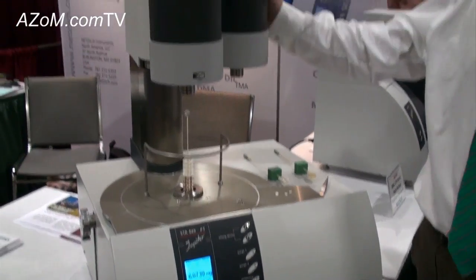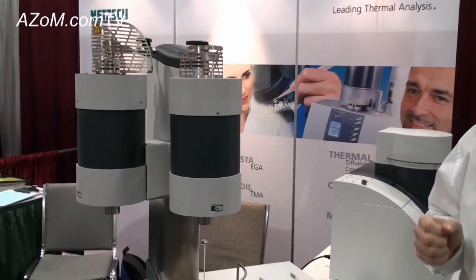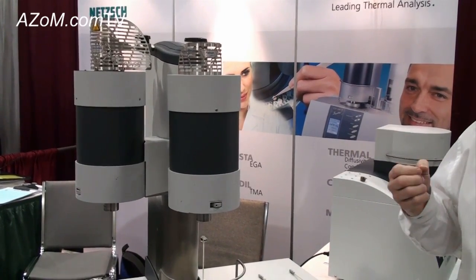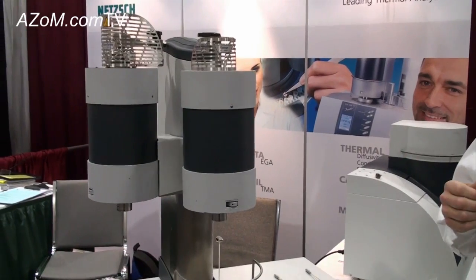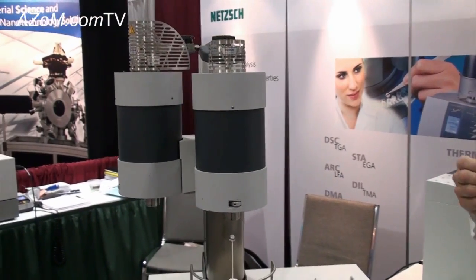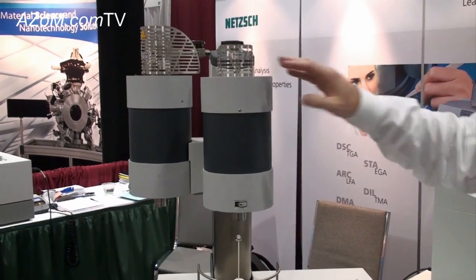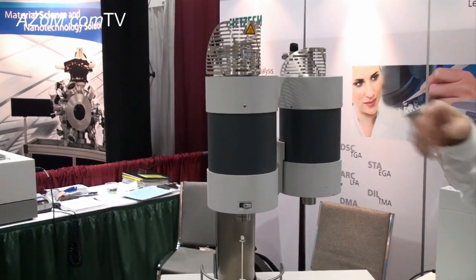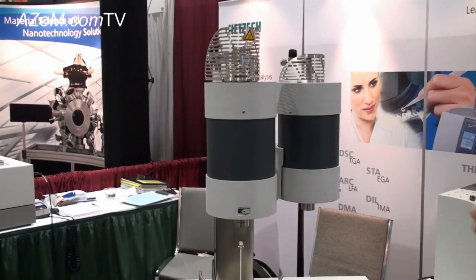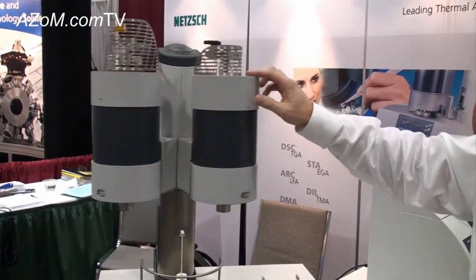We also have special furnaces such as this platinum furnace for measurements of specific heat. Our instrument is very unique in that we can measure the specific heat of a material with an accuracy of plus or minus 3% up to 1,400 degrees Celsius. You can see we can have two furnaces mounted on an instrument, so we can extend either the temperature range or the application range by selecting a particular furnace.